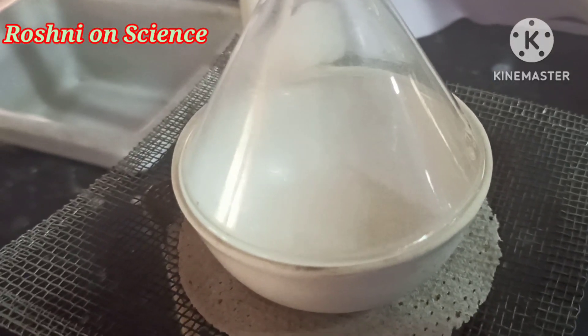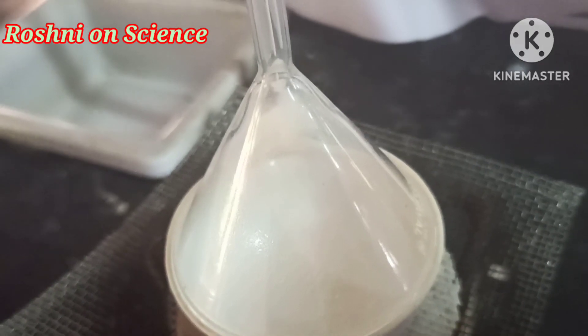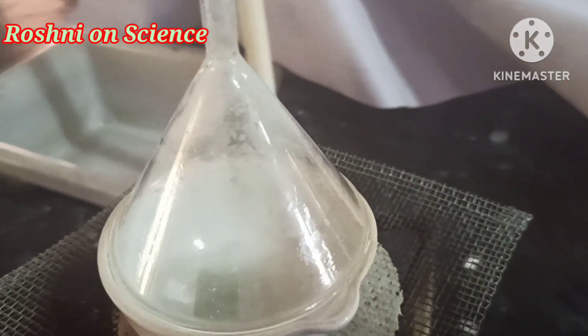Here naphthalene directly changes from solid to gas without changing into liquid state. This process is called sublimation.